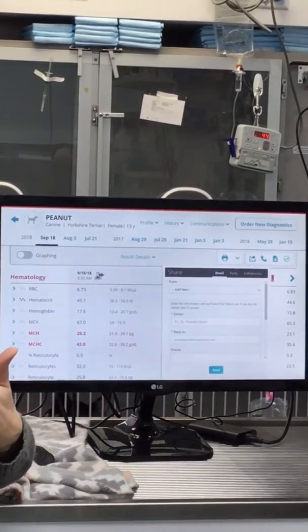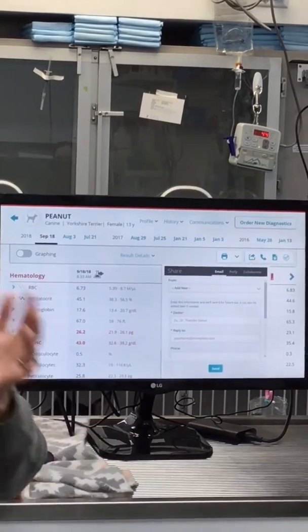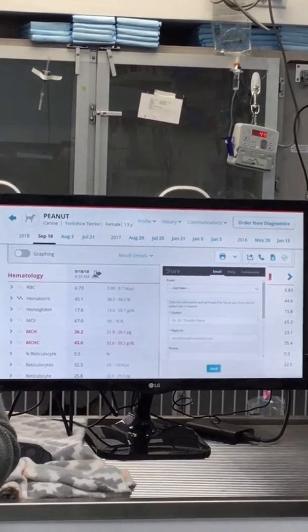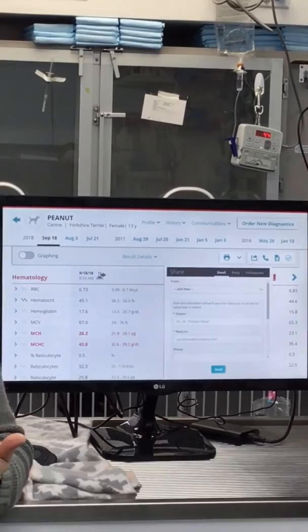So after they accept it, you will be able to see all of their historical data and they can see all of yours. So it will automatically go together so everything can be trended. And you can collaborate for the life of the patient, but you can also stop collaborating. And it's just easy, you just put stop collaborating.